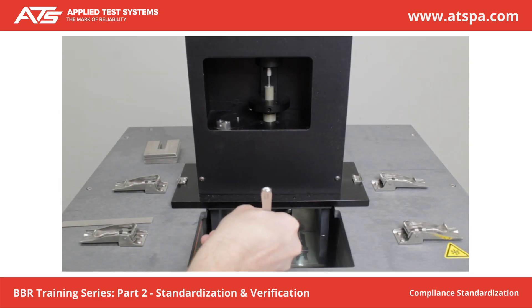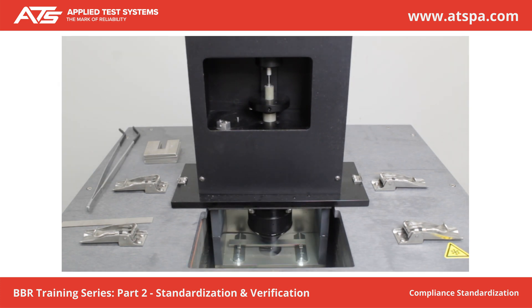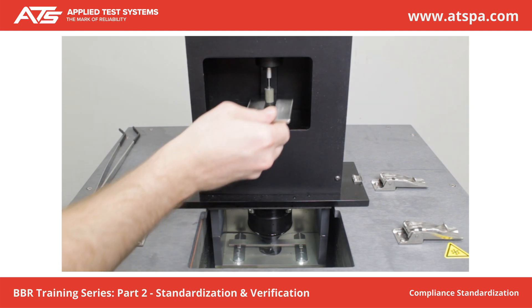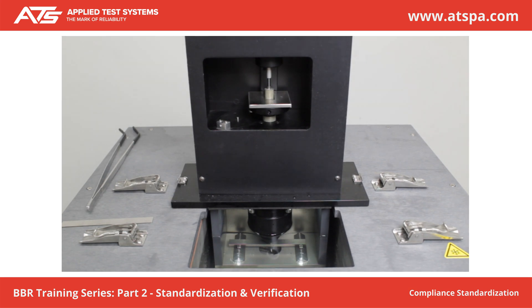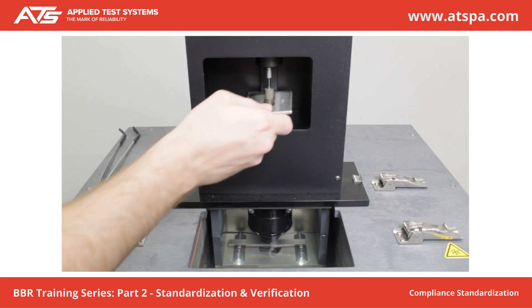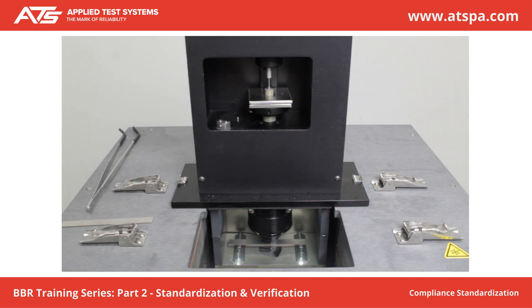Place the non-compliant beam on the sample supports. Adjust the zero regulator to lower the load shaft to the zero position. Press Tear. Apply a 20 plus or minus 10 mN load on the beam. Press Next. Place Weight A on the weight pan. Wait 5 seconds. Press Next. Place Weight B on Weight A. Wait 5 seconds. Press Next.